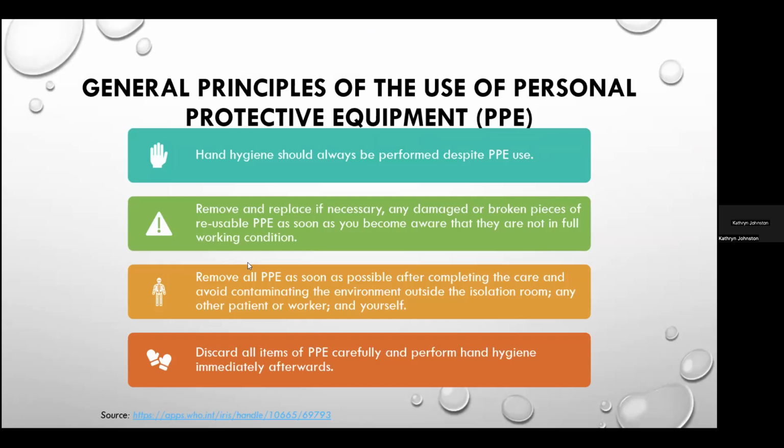So some general principles on the use of it. Damaged reusable PPEs should be removed and replaced as soon as possible. You should never wear your PPEs outside of the isolation room, the laboratory area, wherever it is that you are wearing it to protect yourself.